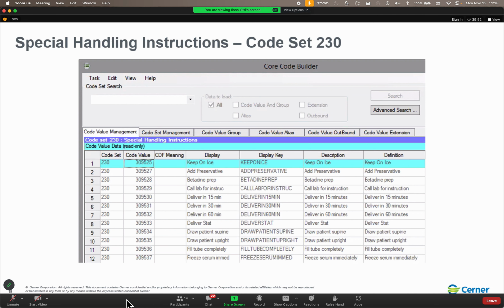Then we're not going to print any more, because a lot of the minimum volumes for our tests aren't the actual minimum volumes. They're just giving an approximation. So this is a way that you can say, hey, after 10 mL of a send out room temperature, don't print any more labels for these orders that have netted into the same set of containers.